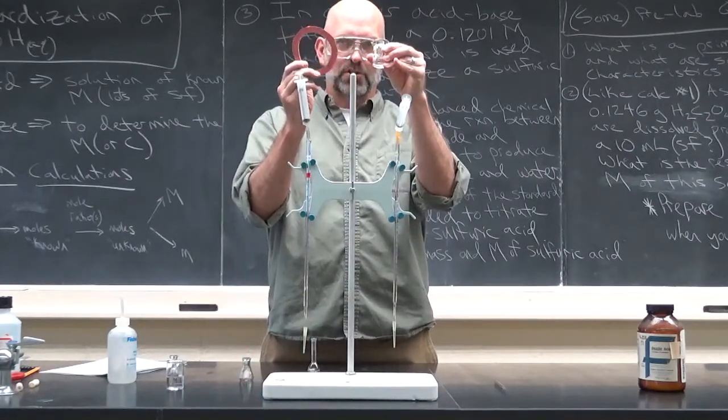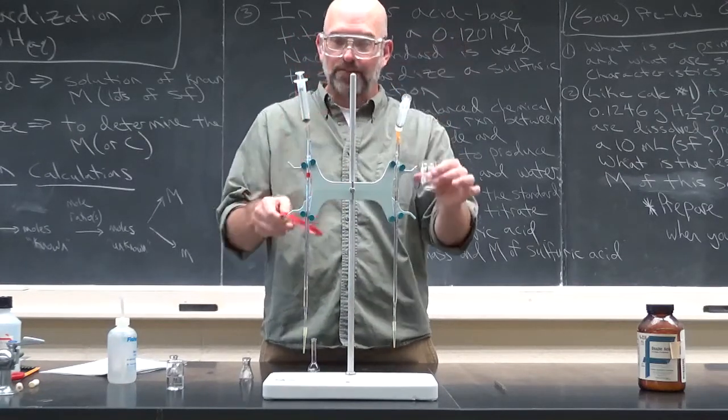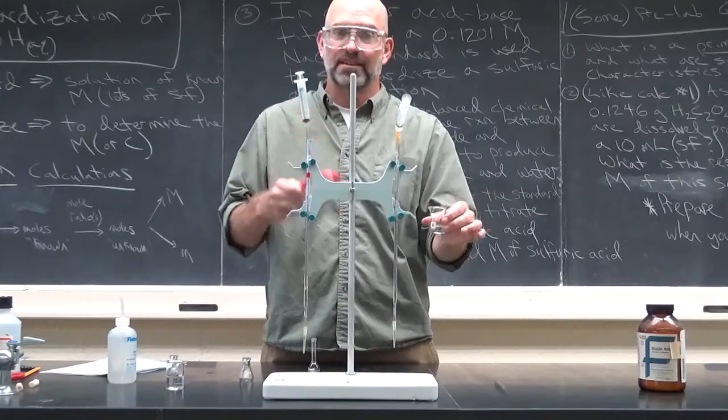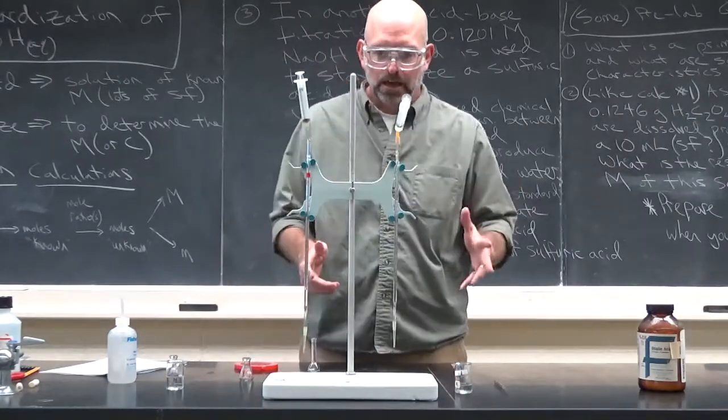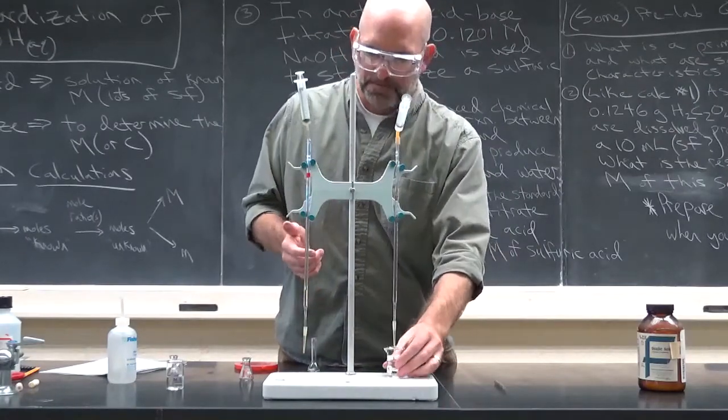So we're going to pretend that you made your oxalic acid solution. It's perfect. Do not try to pull the liquid out of the volumetric flask. The tip will fall off and get stuck in here. So pour your oxalic acid, not all of it necessarily, just some of it into a beaker. And I would label this beaker. Oxalic acid solution, or use the chemical formula and put AQ. I'm not labeling it. That's bad.